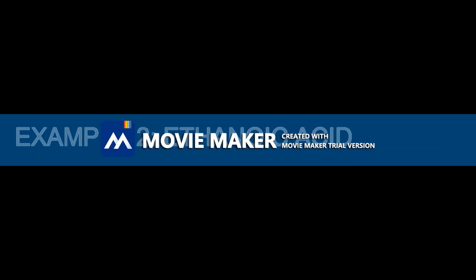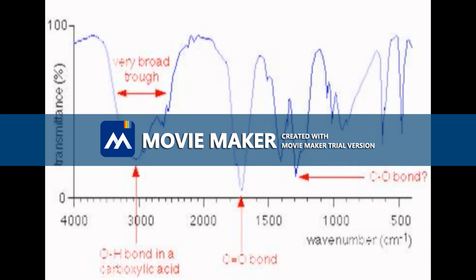Next is example 2 for ethanoic acid. Ethanoic acid also contains a carbonyl group and a hydroxyl group. The hydroxyl group, or the OH stretch, can be observed at the peak range of 3000, where we observe a broad spectrum. Furthermore, the compound also shows a C double bond O stretching at the 1750 range, whereby a narrow spectrum can be seen for the C double bond O group. Adding in other small spectra that can also be observed in the 1400 range and 1300 range for the OH bending and CO stretching respectively.